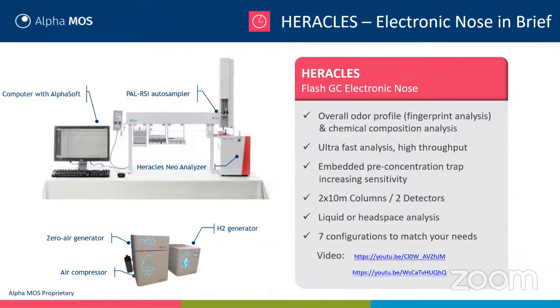Hydrogen will be used for 2 main purposes. One is for the FID detector, which means we need hydrogen to burn with oxygen. And secondly, we use hydrogen as carrier gas. In normal GC and GCMS, helium and nitrogen are used as carrier gas. Speaking of performance, helium is a little better than hydrogen, and much better than nitrogen. But we know that helium is very expensive, so by using a hydrogen generator, it's much safer, and hydrogen performance is also quite good compared to nitrogen and helium.